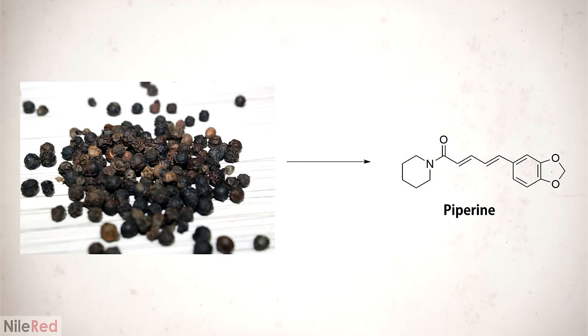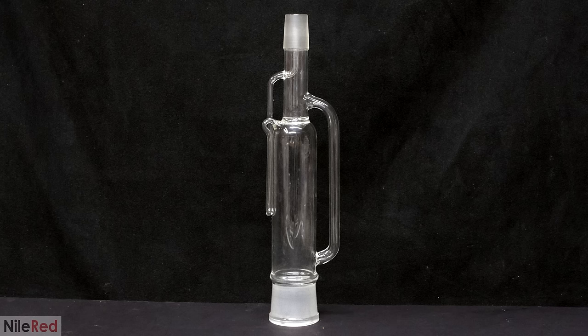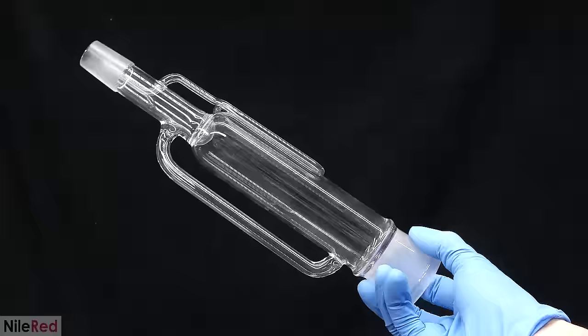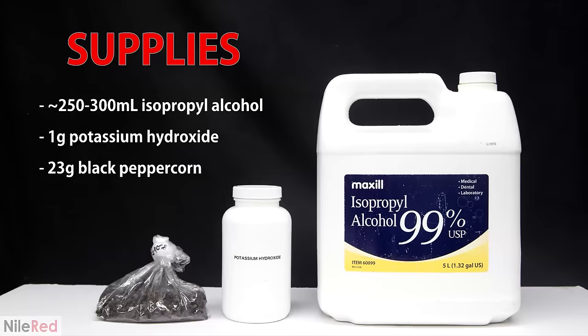So today I'm going to be extracting piperine from some regular black pepper. The classic way of doing this requires repeated solvent washings which is both wasteful and labor intensive. To help me out because I'm lazy, I've decided to use a Soxhlet extractor which will allow me to do less work and use less solvent. The Soxhlet extractor is actually a really cool piece of glassware and I'll explain exactly how it works later in the video.